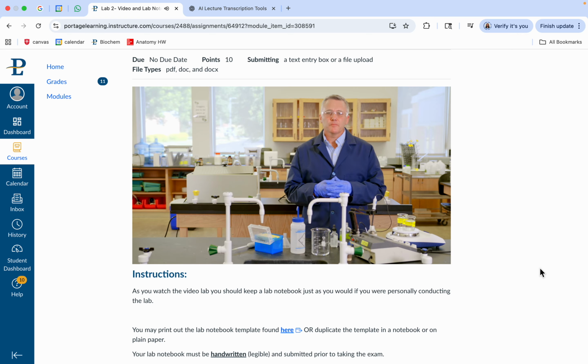So we've made a phosphate buffer, and the phosphate buffer is something we typically would make in the lab to buffer the pH. We know that it's important for biological systems, but we know that biological molecules, such as amino acids and sugars and other types of compounds, can have pKa values, and they can buffer on their own.